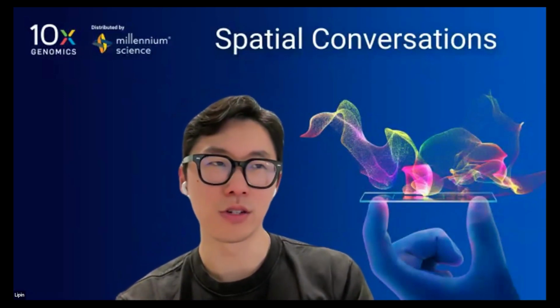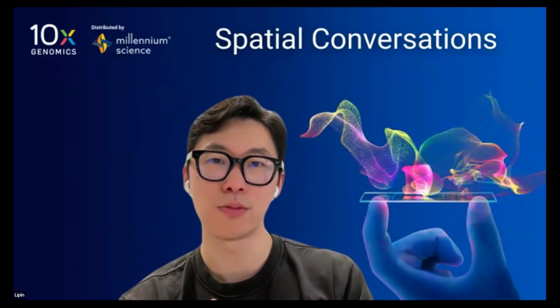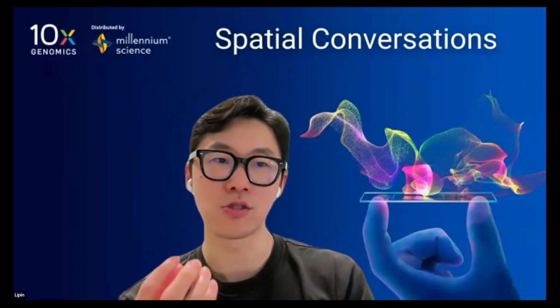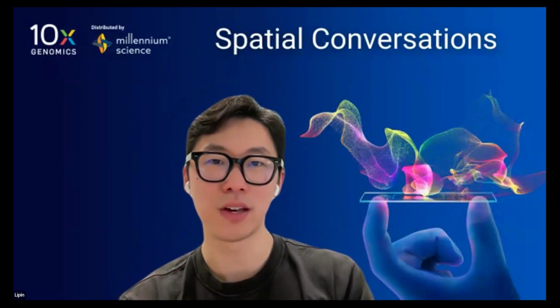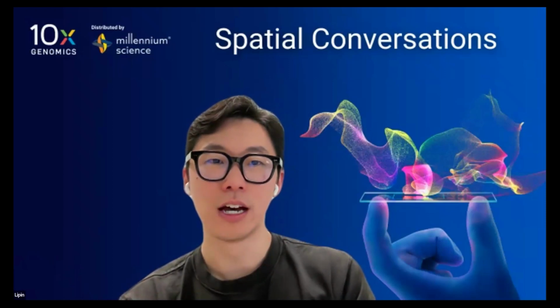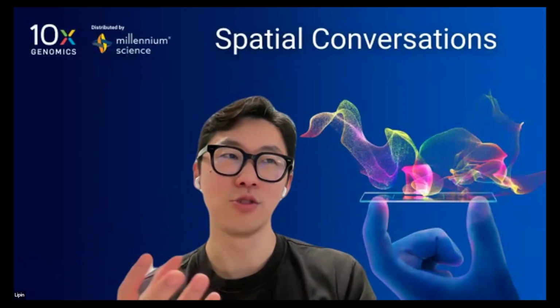We had a spatial meeting earlier this year with other users, and someone in Melbourne did a benchmarking of the different stains or different methods of segmentation. They said that the nuclei expansion method actually works as well as the multimodal stain, because if you're very conservative in what you're calling a cell, say 5 microns away from your nuclei, you run a lower risk of having doublets or something segmented together.